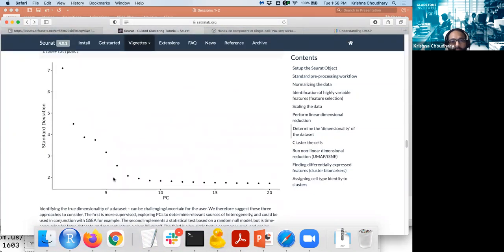So here you can see that there is a very long plateau, which means maybe selecting 10 or 15, maybe if we want to err on the higher side. Selecting more PCs than fewer will not be so harmful as selecting fewer than what is appropriate. So if you have to be more conservative, then err on the higher side. It will come with some additional computational cost, but I think 10, 15, and adding 5 more components will perhaps not be that expensive computationally.